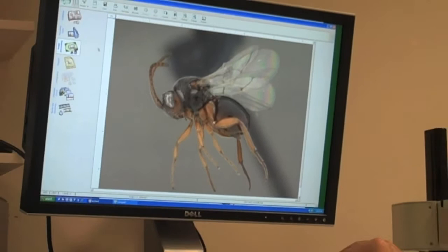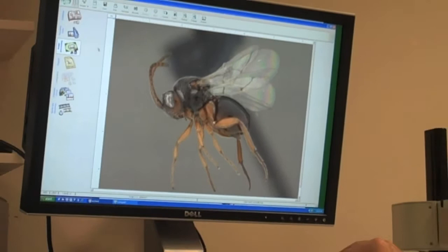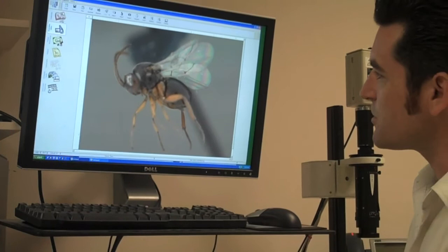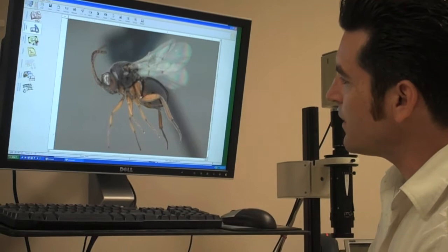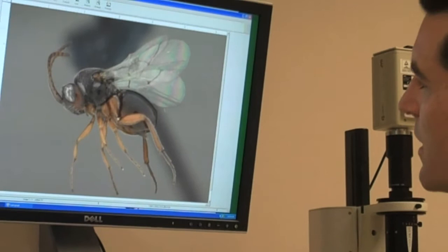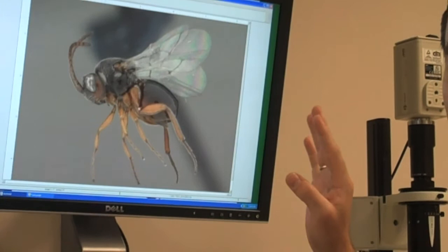Now if we look at the original image, this is a real-time video right now of the specimen. And I'm going to focus through it. I hope the camera can pick this up. But you can see as I focus through this, I can't get the whole wasp in focus at the same time. But my composite image does get it in focus all at the same time. This has been a revolution in how we photograph insects and how to use those photographs for scientific illustration.